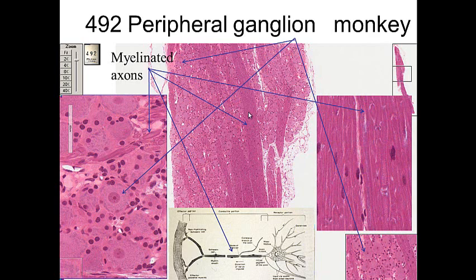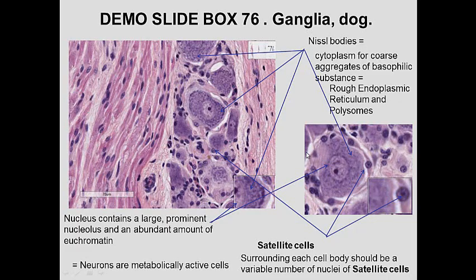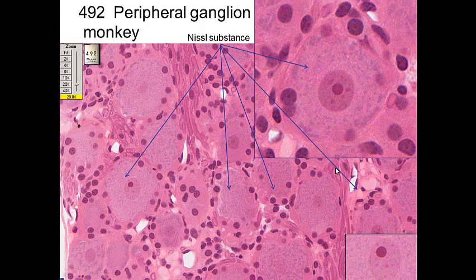This is another view of the ganglion. Here we see the ganglion in a dog. Here's a cell body; there's a nucleus, a nucleolus. Nissl substance is what we see there — it's really aggregates of ribosomes, which could be on rough ER or just polyribosomes. You can see the nucleus is very euchromatic, kind of like a snake eye with the nucleolus. Euchromatin is indicative of a metabolically active cell. We see the little satellite cells which are support cells at the periphery. Higher mag shows the Nissl substance very nicely.